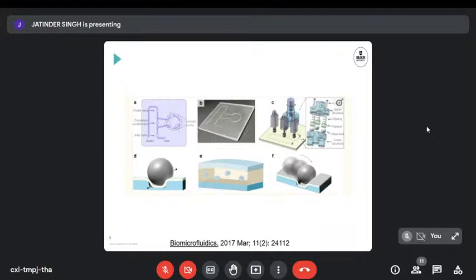So while we have a little bit of a hard-to-use mechanical setup, the advantage of mechanical lysis is that we don't add any reagents. Because if we do add any chemicals to our lysate, we increase the risk that these chemicals will be transferred through our cleaning process into amplification. And during amplification, they may inhibit the effectiveness of the enzymes that do the amplification and prevent us from having a proper readout. So the use of chemicals, whilst really effective, needs to be done in a conservative manner as well, because otherwise we may get problems further down the track.